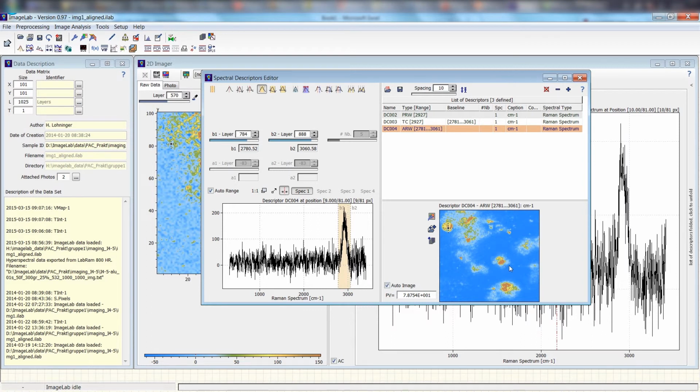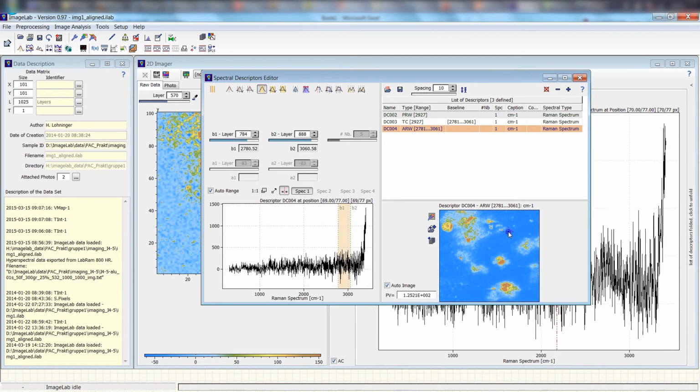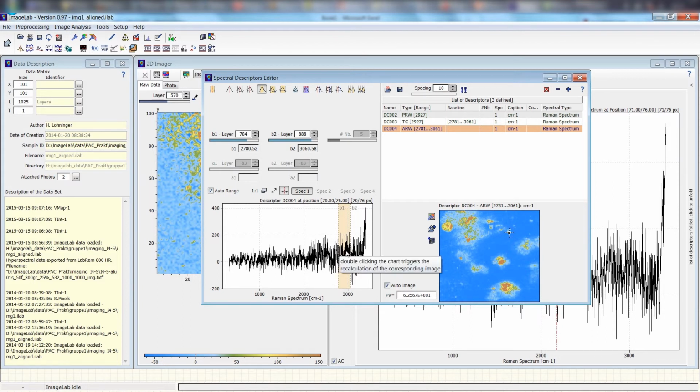But there are some fake peaks or fake spots which are maybe just spots which happened to be created simply from the fact that the noisy data is just on the average not 0. And as you see here in this particular tiny spot, you get here noisy data, but the average of these noisy data points is around 100, and of course this creates a spot because only those parts which are zeroing out will create zero levels.